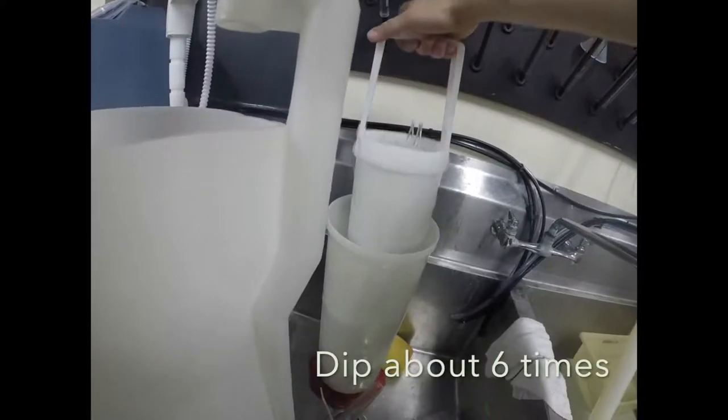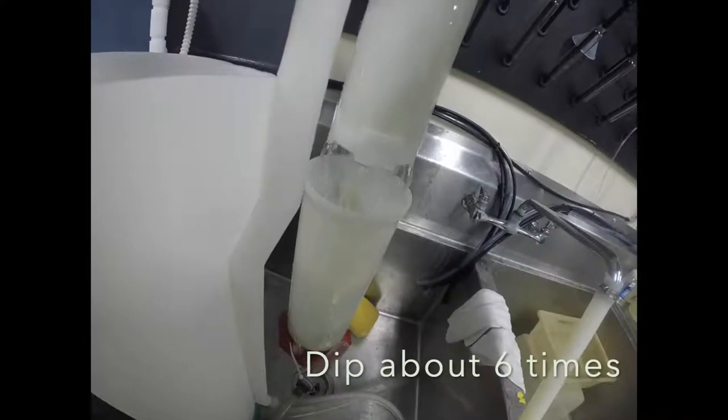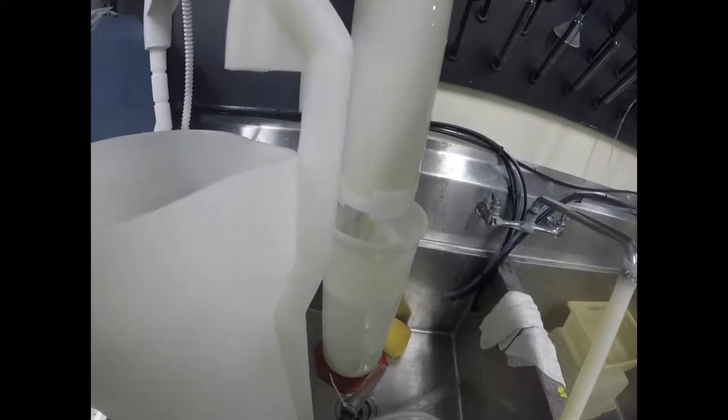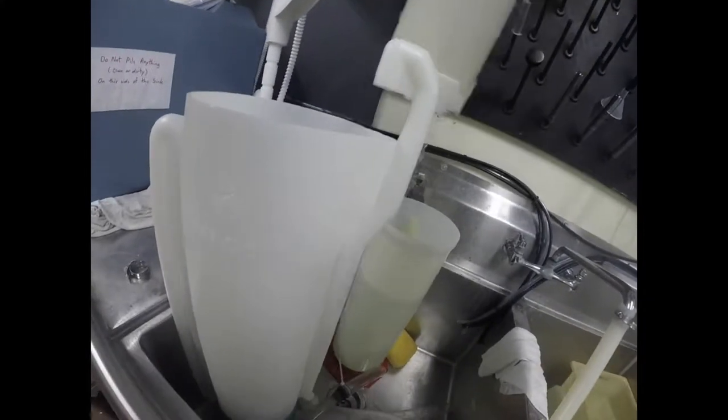So you're running it through. Do it like 6 times or so. Just put it up and drain it out. And when it's all good, you can put it in the pipette cleaner.